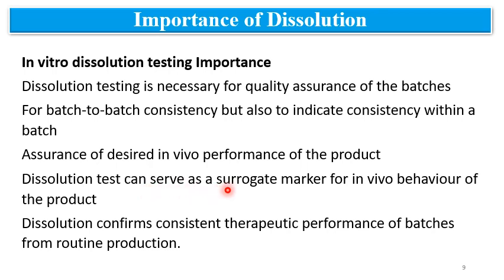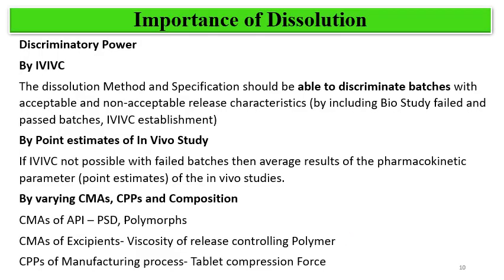Dissolution test can serve as a surrogate marker for in vivo behavior of the product. Dissolution also confirms consistent therapeutic performance of batches from the routine production. So this is the importance of dissolution testing.